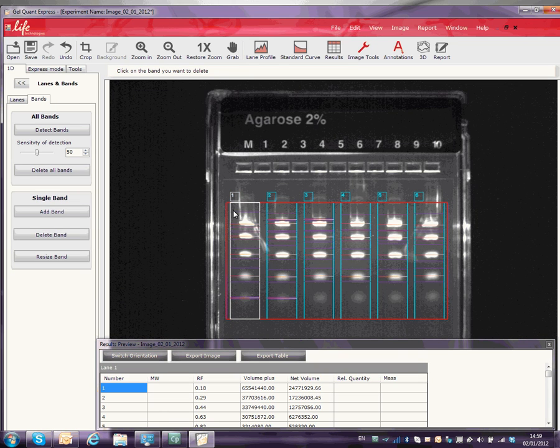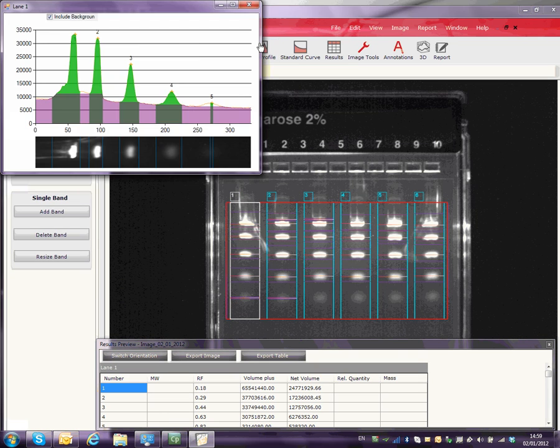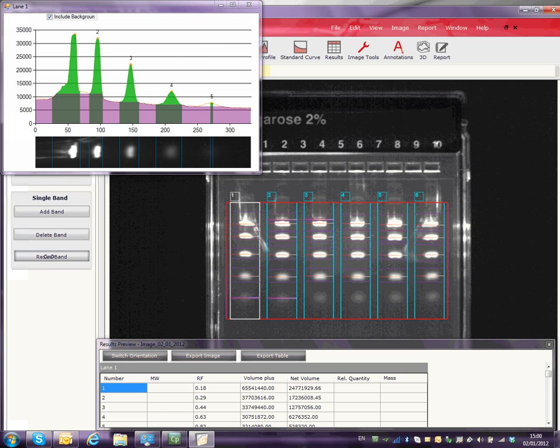Click on the top of a lane and select the Lane Profile. The Lane Profile will allow you to adjust the width of each band to ensure you analyze it correctly. Click Resize Bands to adjust band width.